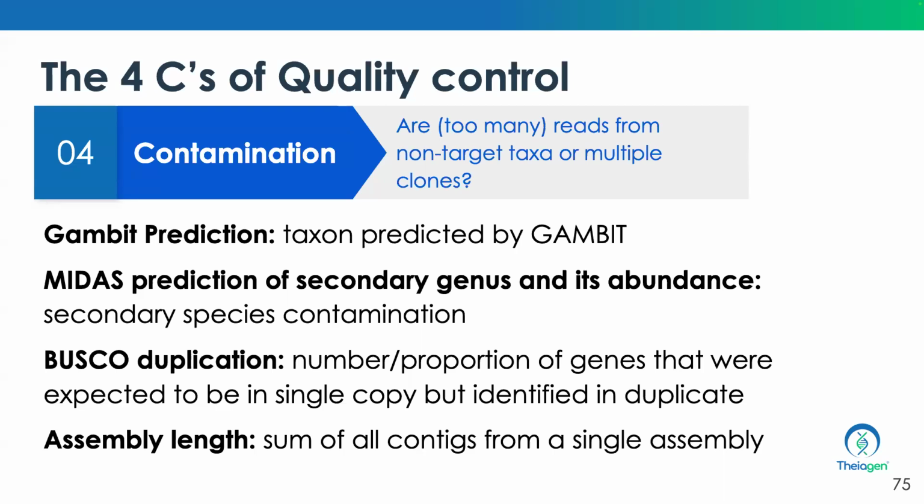either might mean that your pathogen suddenly acquired some plasmid that you don't know about and it's pretty big, or you just assembled a different pathogen that is really not what you're targeting, or it's too short, which, if it's nothing to do with completeness of your genome, then it could also be an indicator that you're basically working with a contaminant that is not your target pathogen that you're analyzing.